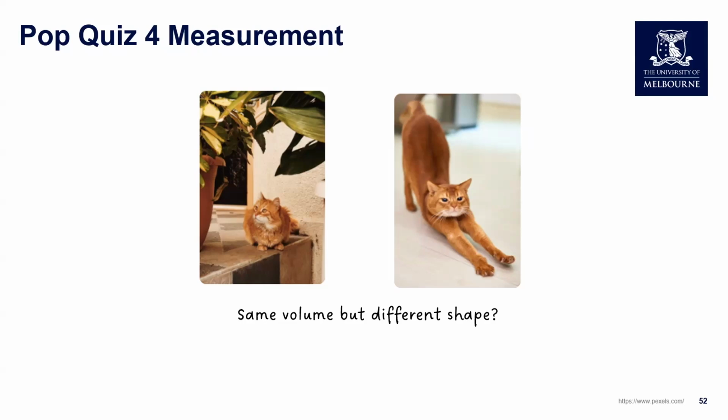The first question was, what's the best quantifier for comparing brightness of microscopy images? The answer is absolutely mean intensity. The coefficient of variation came up a bit high. I guess the coefficient of variation is really measuring how varied your intensity is within the object. So if you want to measure granularity or heterogeneity, that might be a better measurement.